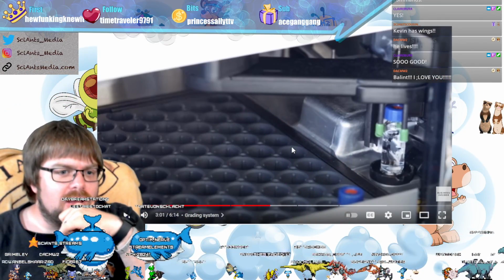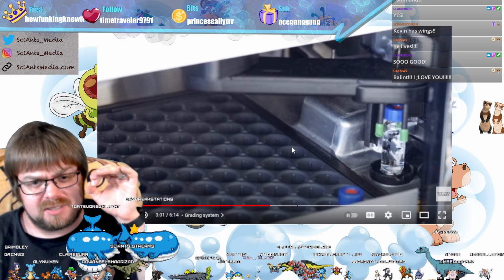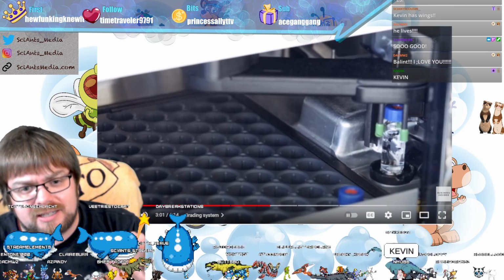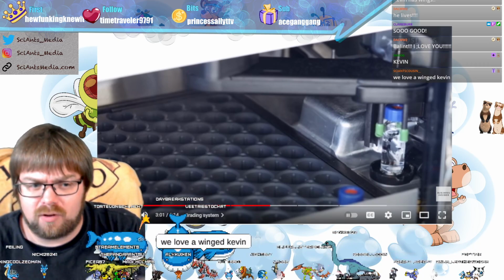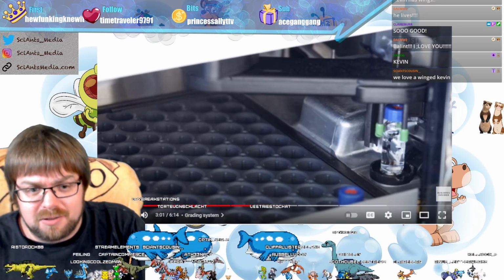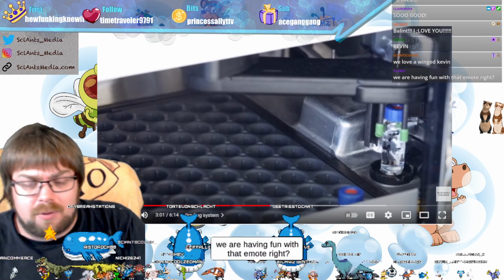So, my friend Michael has done this where he's run 24 samples and it just ran for a straight day. The big issue with that is the machine can have hiccups where it'll just stop working. And so you have to be very careful when running the samples. Like, you're not running anything too precious because you end up going to lose the sample, and that's less than ideal too, right?